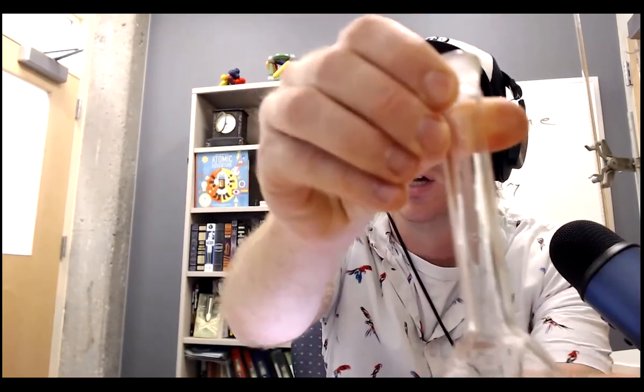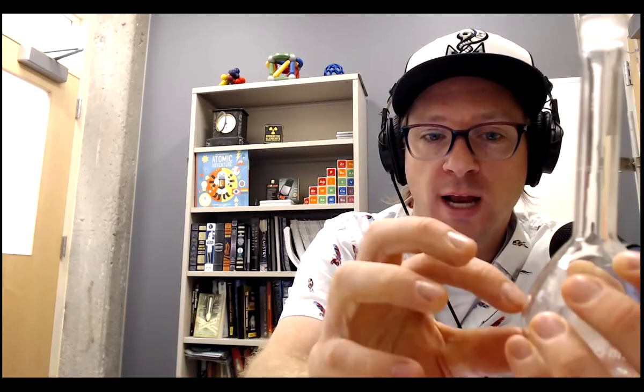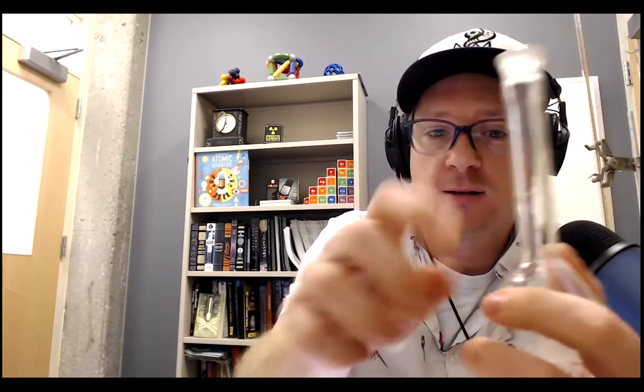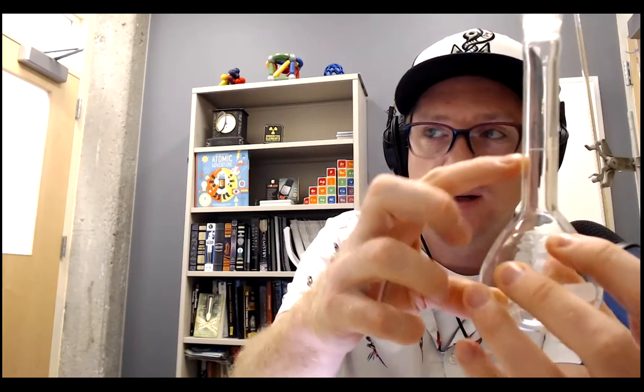Here is a 100 mL volumetric flask. There, 100 mLs. There's a white line right here. So you're going to put your solid in, whatever you figured out from your calculation. And again, maybe you should verify with me. You're going to put that solid in here, and then you're going to add water. You probably want to add just a little bit of water and stir it really good. Then add a little bit more water, stir it really good. Don't fill it up right away, because then it becomes really hard to mix.